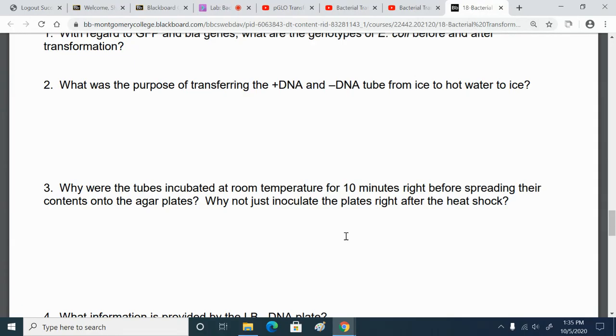What are they doing? Anyone have any ideas?